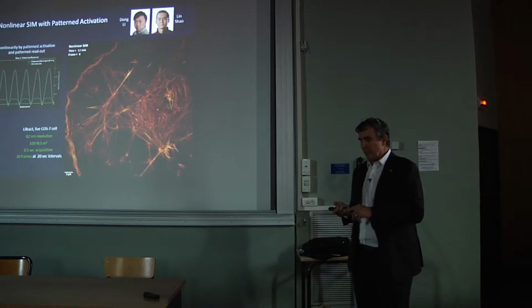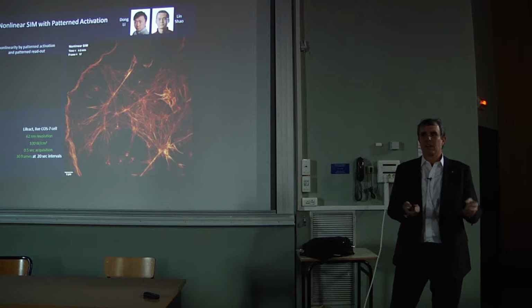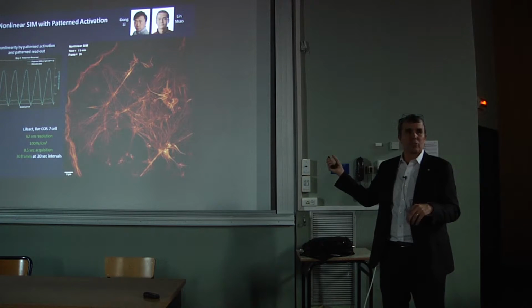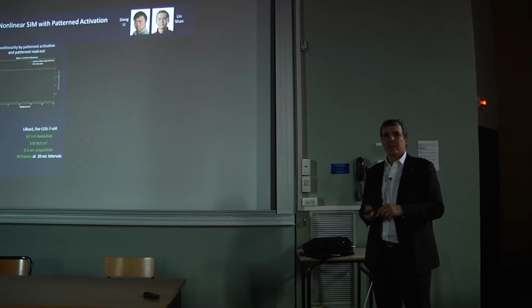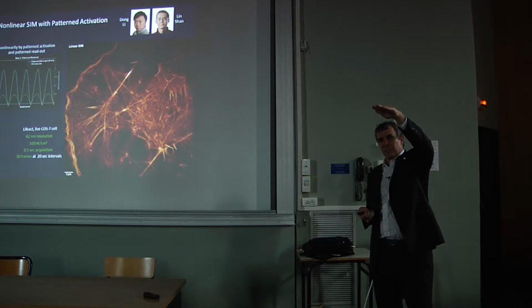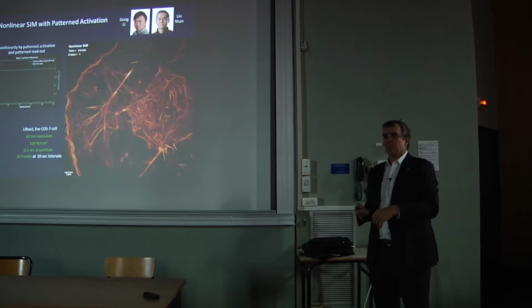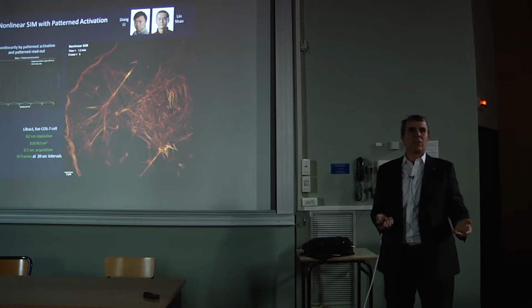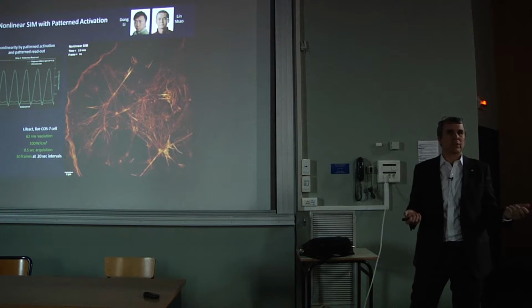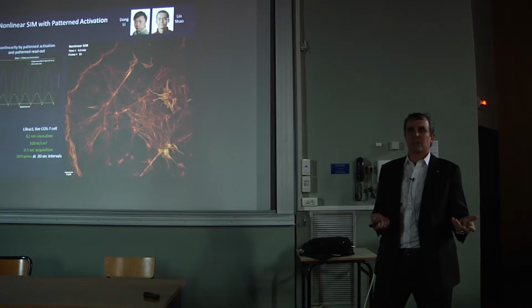And so what we realized as we thought about that is that this principle of saturated depletion, which is the principle behind the STED microscope and the RESOLFT microscope in that previous form I just showed in the last slide, is really not a good way to do live cell imaging, because you're taking all of the molecules up to an activated state, and then the vast majority just go right back down to the ground state. When they do that, they're not contributing anything to the image at all, but every molecule can only undergo a finite number of switching cycles before it's going to bleach. And so you really lose your molecular budget quickly by doing that.